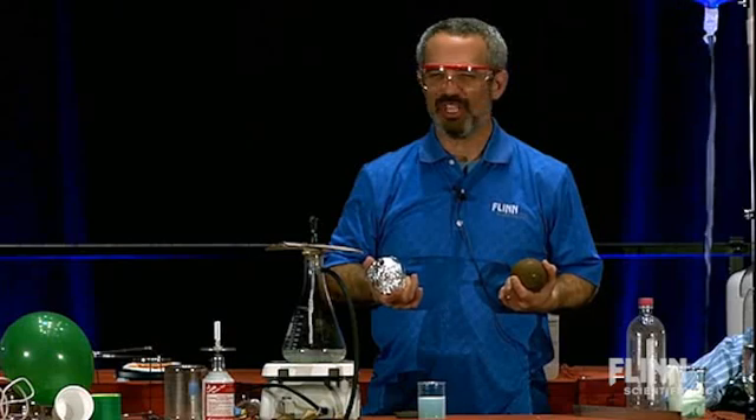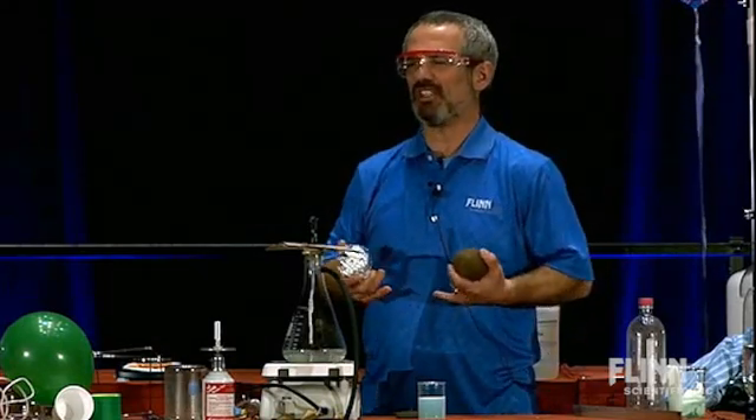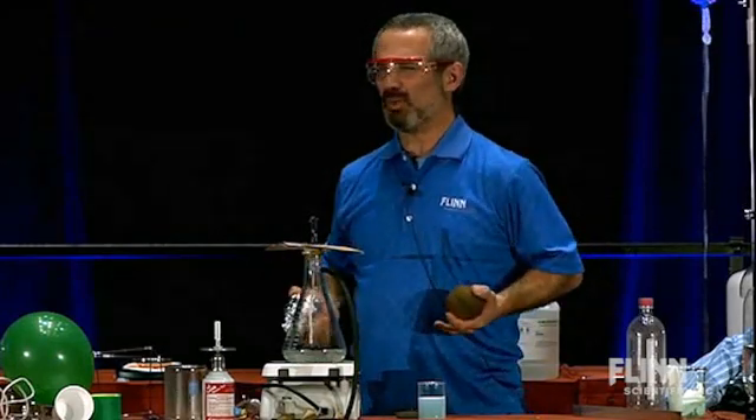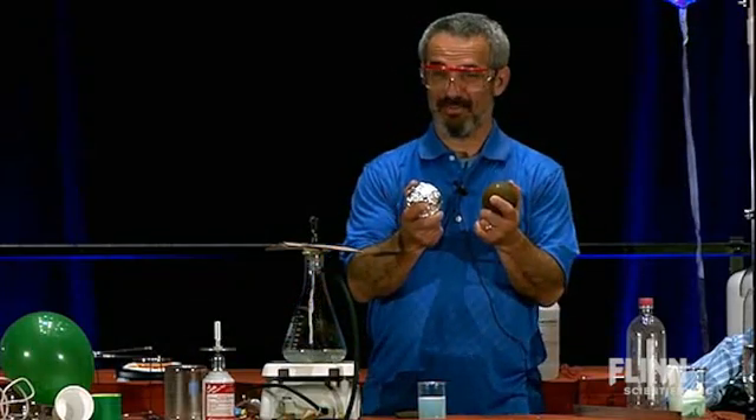Generally, we don't see reactions between solids. There's not very good contact between solids. We always have things react in solution, or as gases or liquids. But two solids reacting? When does that happen? You've really got to force it to happen here.